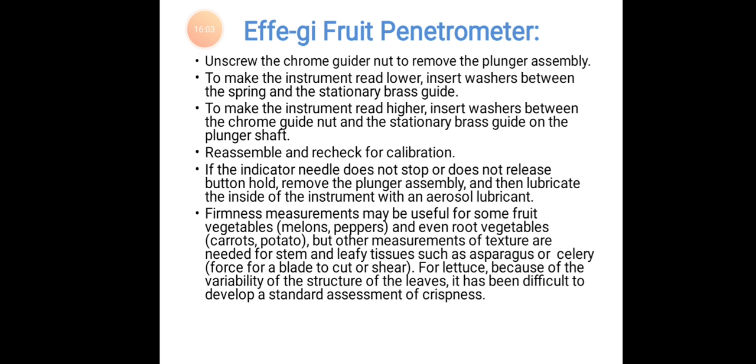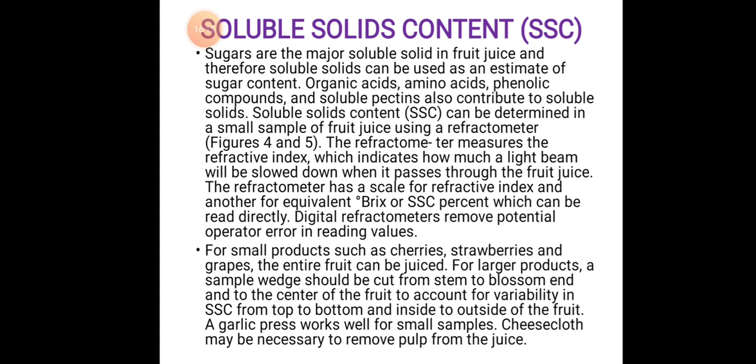Force for a blade to cut or shear. For lettuce, because of the variability of the structure of the leaves, it has been difficult to develop a standard assessment of crispness. Soluble solids content, that is SSC.